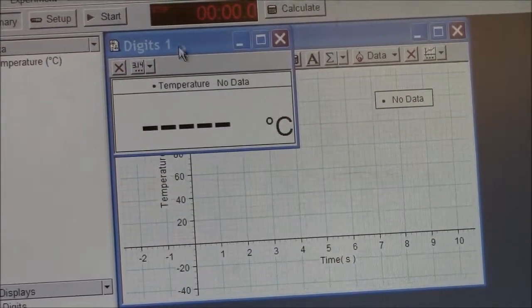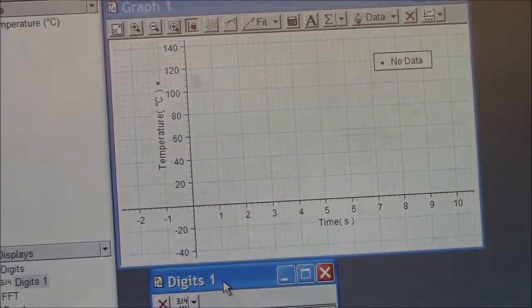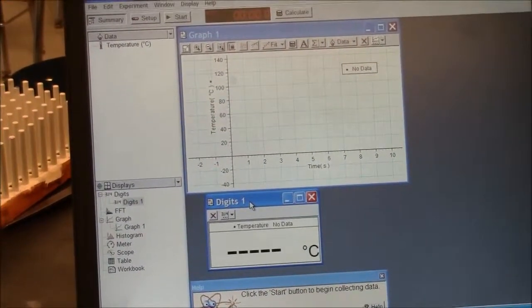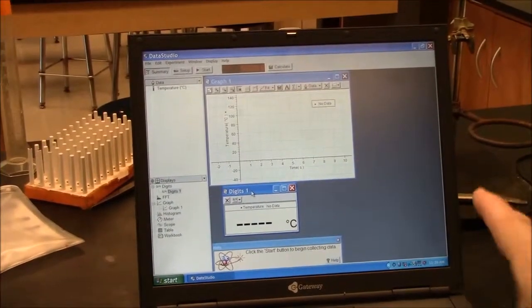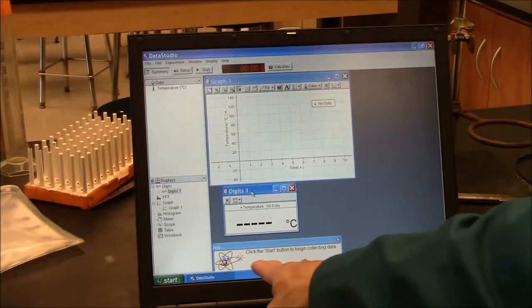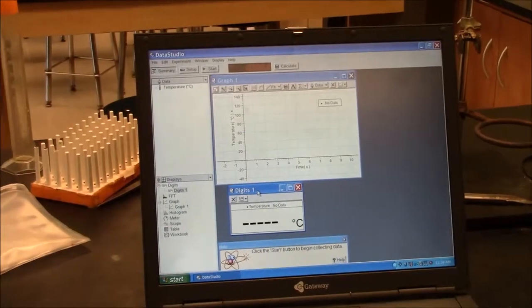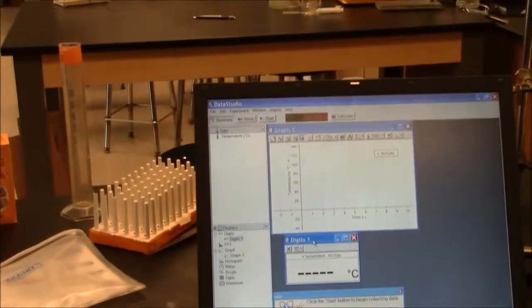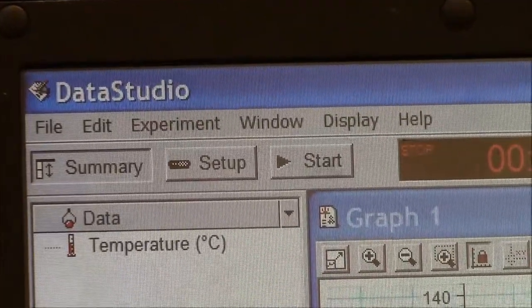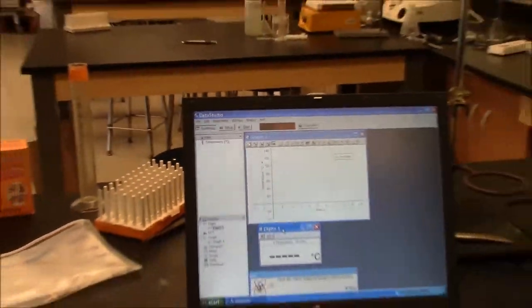I'll click and drag that so it's not covering up my graph. So now if I zoom out, I have a graph screen here, a digits window here, and at the bottom is the help guy who says click the start button to begin collecting data. So the start button is up here at the top, clearly labeled start. So I'll click on that to begin collecting data.